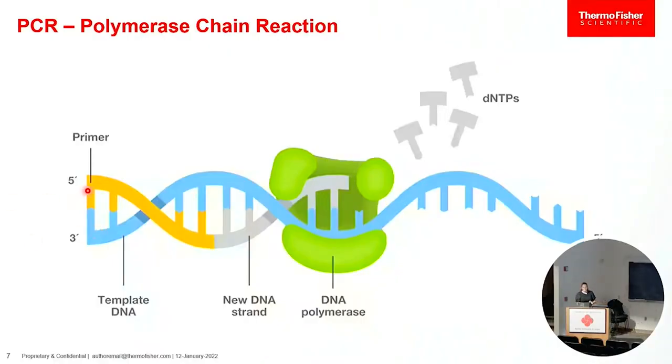When we have the primer in solution at our appropriate temperature, that will bind here, and that's in yellow. And then the enzyme will bind in front of that and start building. So whatever's in front of it, it matches the next base, and it moves to the next step, and it just keeps going, and it builds and builds and builds.